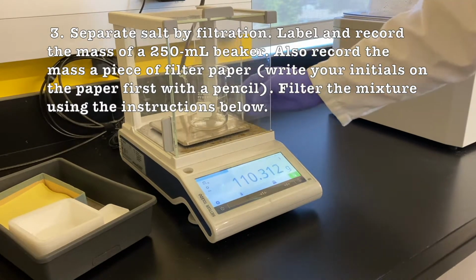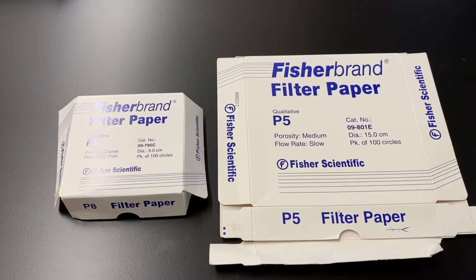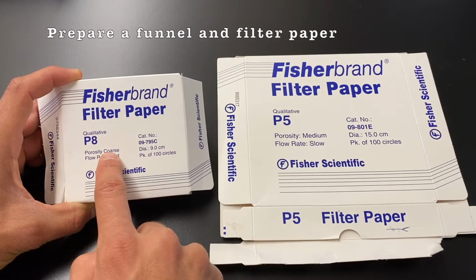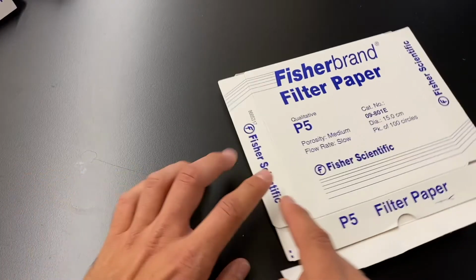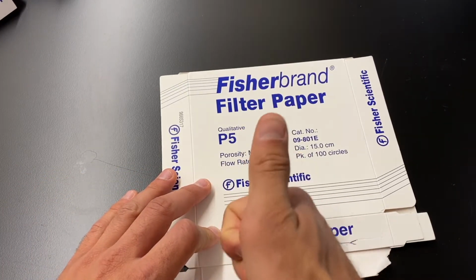So now we're going to mass an empty beaker. And this beaker is ultimately going to have our salt in it. Once it fills up with the salt, we can subtract those masses to get the mass of the salt. We actually have different kinds of filter paper we can use for filtration. We want our porosity to be medium and our flow rate to be slow. This gets us a better filter.